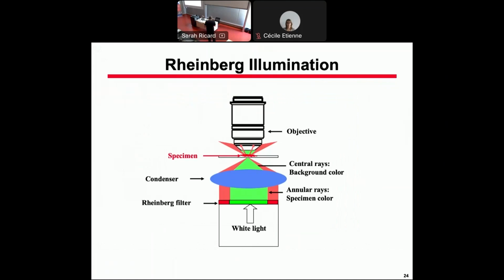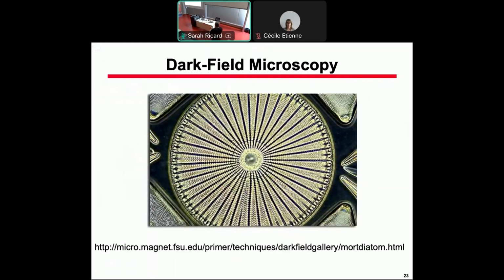Reinberg, he came from a concept, and then one of the very big reasons, which is often forgotten, of fluorescence microscopy is that it's a dark field. You have no light, you have light when you shine excitation light, and you have no background. So that's why, for example, single molecule tracking is possible in fluorescence microscopy, because it's much easier to detect a little bit of light on a dark background than a small change when you have high intensity.